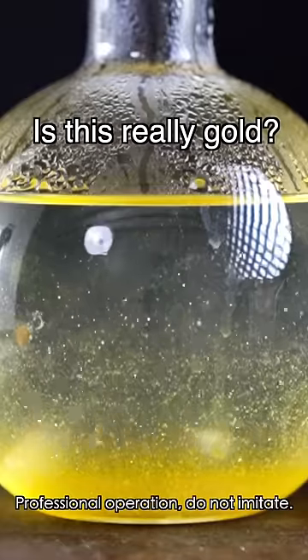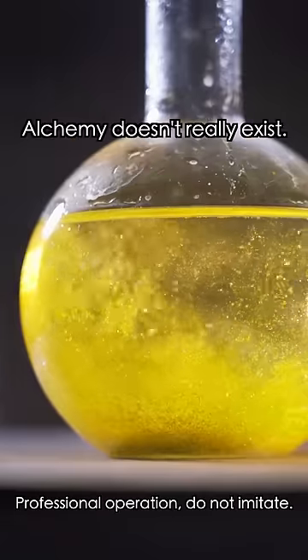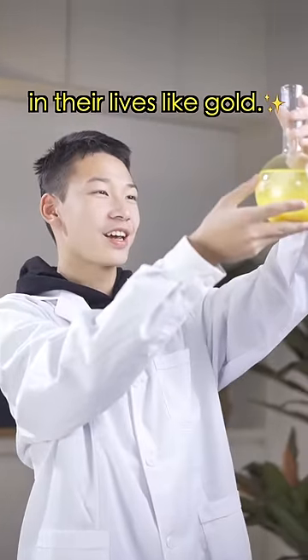Is this really gold? You wish. This is just lead iodide crystals. It doesn't really exist as gold — but I believe that everyone can shine brightly in their lives like gold.